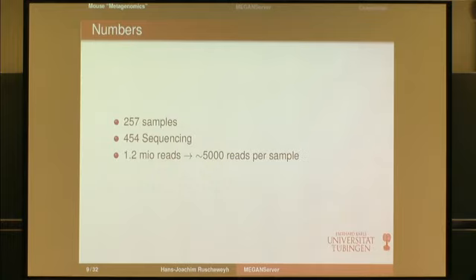There's just a problem. We have samples with 500 reads and we have samples with 15,000 reads, because in between we changed the sequencing facility. So it's not as comparable as you would actually like it to be.